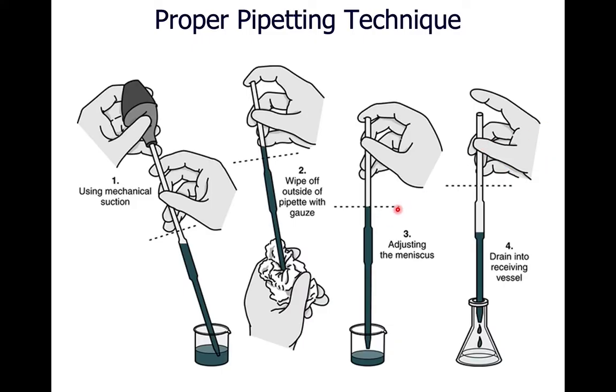All right, I want to talk a bit about pipetting techniques, because we do have some danger here when we're using the pipette. So the pipette is a long hollow glass rod, and what you most certainly don't want to do is ever have basically your hands too far apart on this.